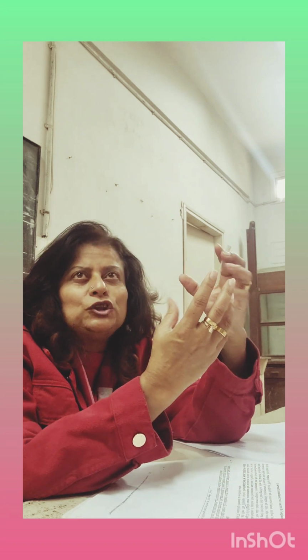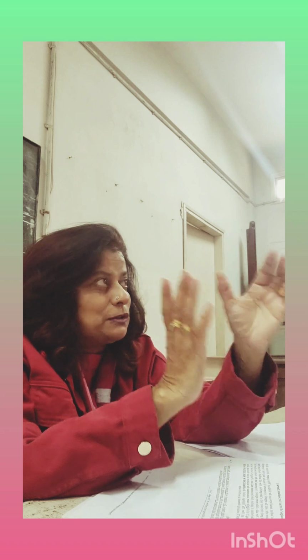Sometimes you have seen your utensils when you keep them over fire, they get red in color, right? They get a reddish tinge over them. Why? It's because of the strong heating. The same way you will see a tinge at that moment. You're going to drop your ignition tube inside that china dish containing 20 ml of water, like that, right?